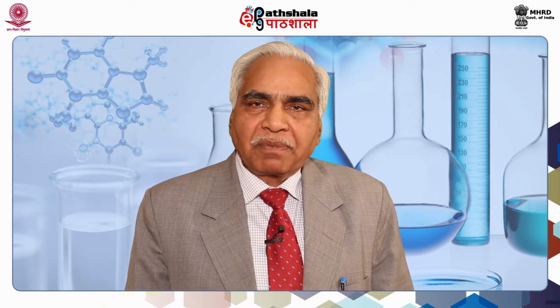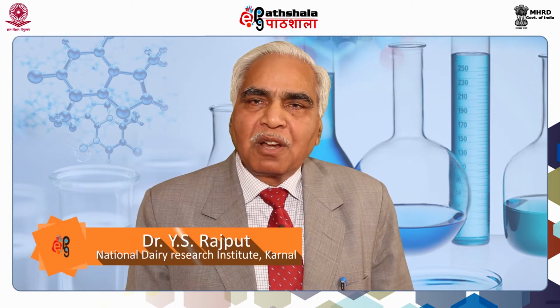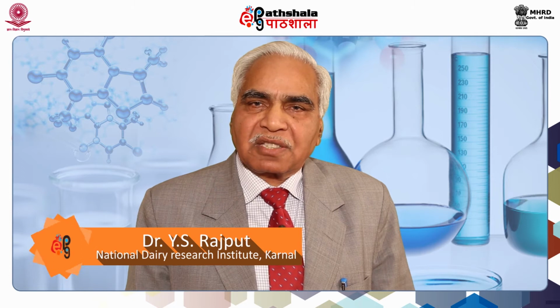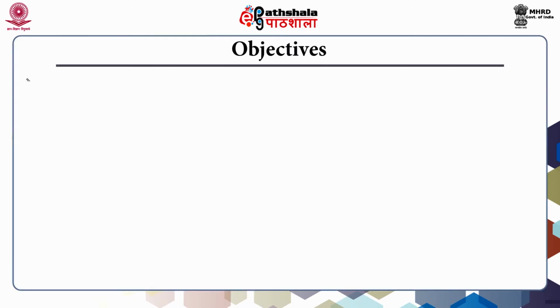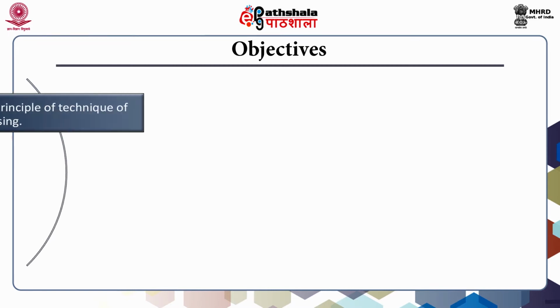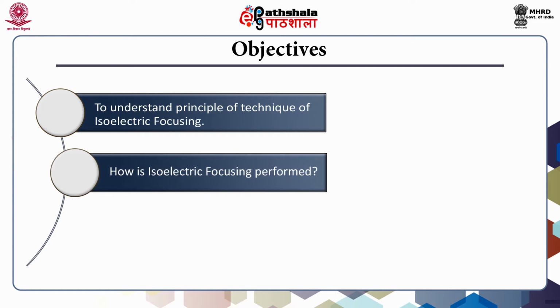I am sure that after listening to this lecture, you will be able to perform your experiments more carefully with a success rate as high as 100%. The objective of the presentation is to make you understand the principle of isoelectric focusing. I will also be covering how the technique is performed.